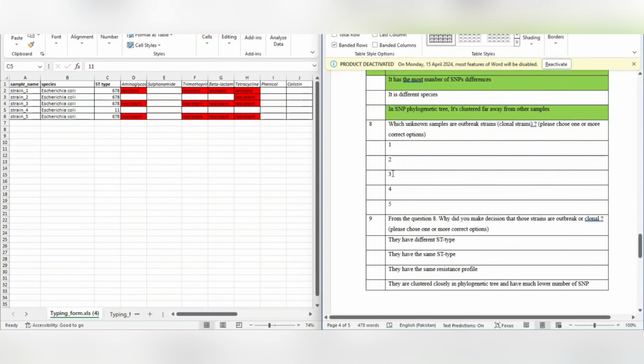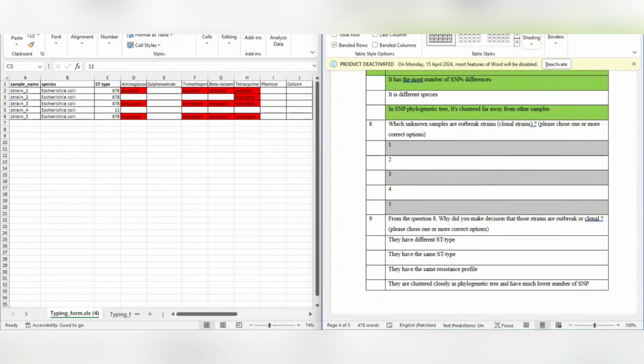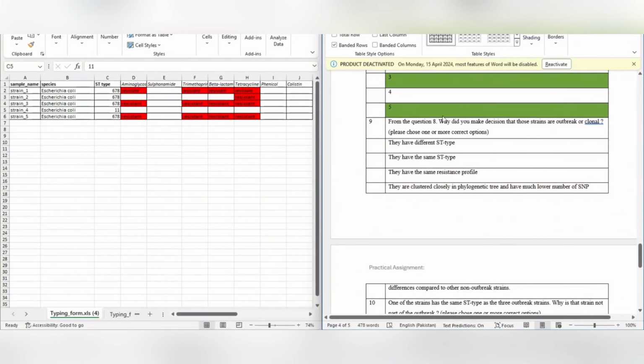So antibiotic microbial resistance is the most dangerous outbreak we will face in the coming years. So the more resistant the bacteria is to the vast or broad amounts of antibiotic, the more dangerous it can cause outbreaks. So we will select those which are most resistant to the antibiotics.